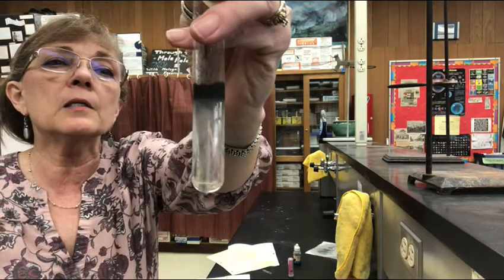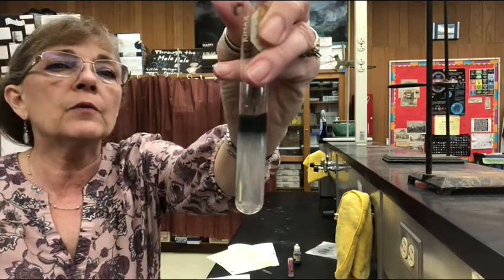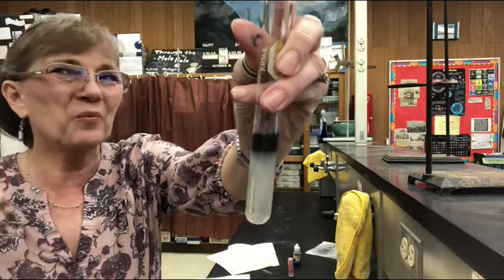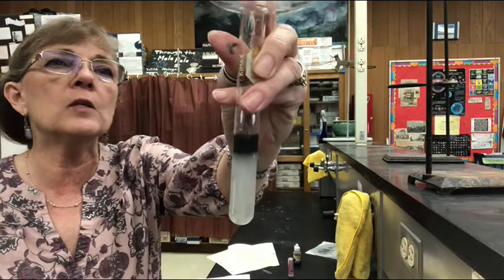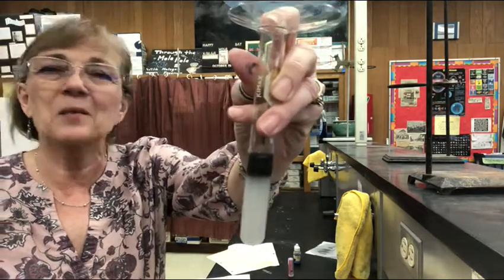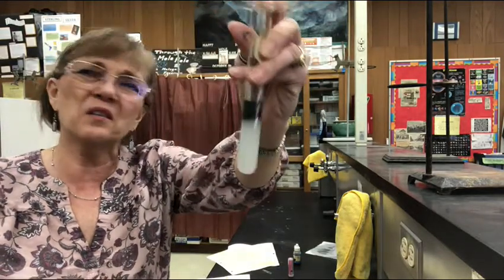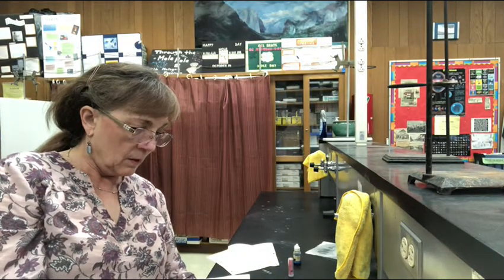So the manganese dioxide, the catalyst, is recoverable after the reaction. It doesn't become part of the products. It's not really a reactant. It's just helping speed it along. You might remember from biology that enzymes are catalysts, excuse me. So this is a catalyst that we use. There's other things you can use besides the manganese dioxide, but this is the one that I like to use.